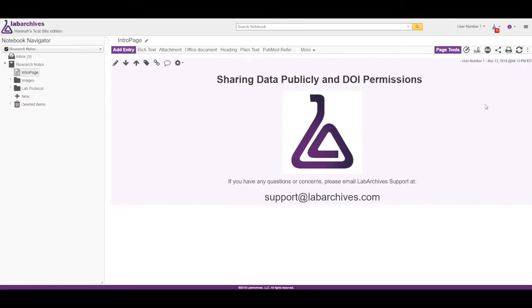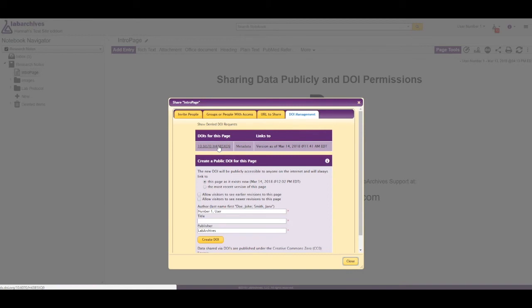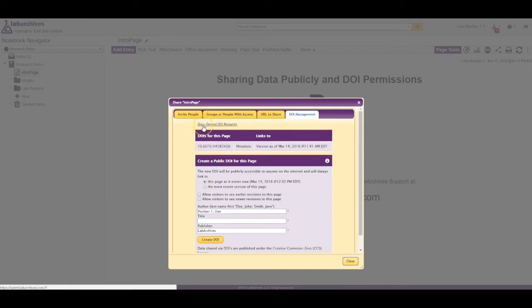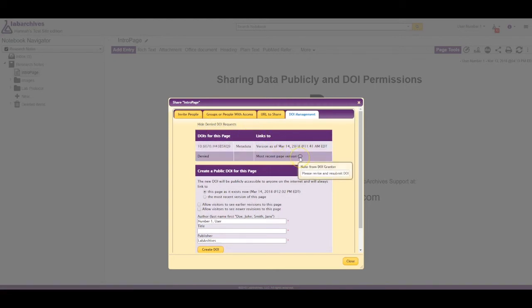If your DOI is approved, you will see it listed on the DOI Management tab of the Share dialogue. To view a denied DOI, click Show Denied DOI Requests. To view any notes made by the grantor, hover your mouse over the Comments icon.